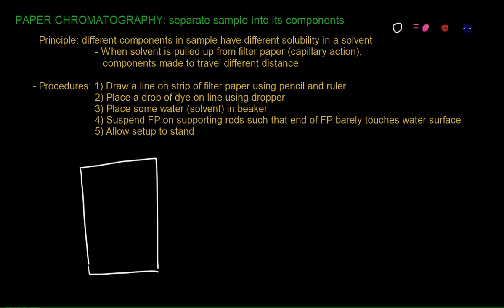Of course there's a lot more to it, but we just use 3 colors in this case. So this black dye in water will break up into 3 components.